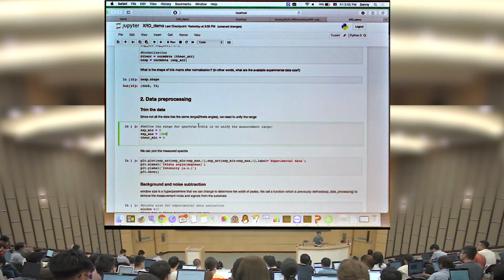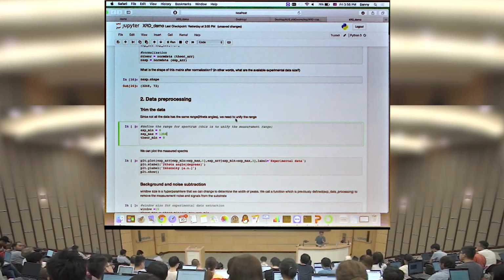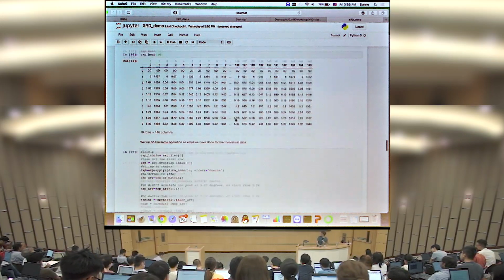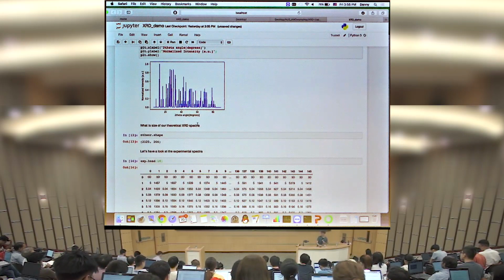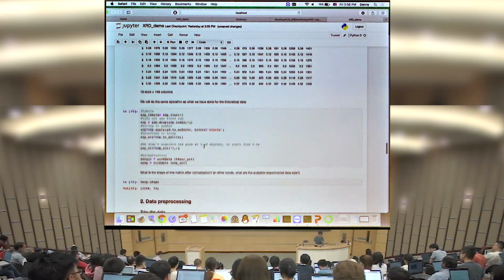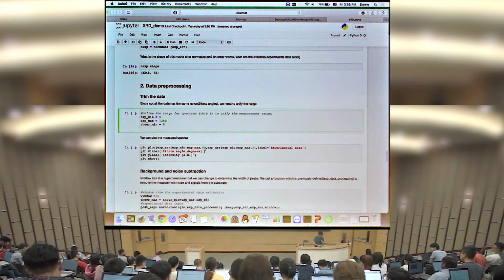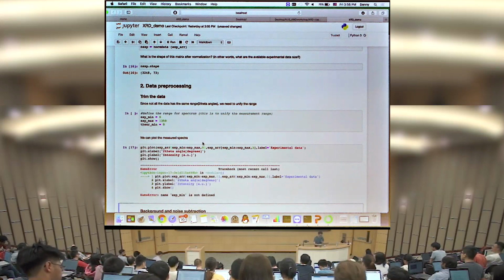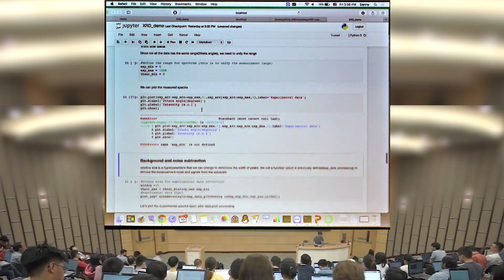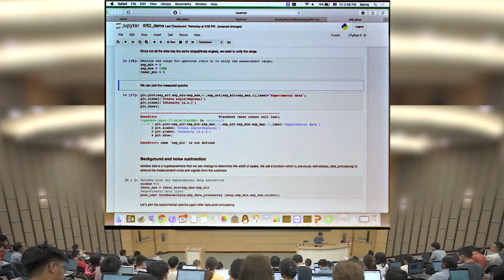First of all, we need to unify our data to be able to put it into the machine learning classifier. Because our x-axis is the 2 theta angles, we want everything to have the same starting and ending point for the 2 theta angles. So let's trim the data first. Oh, sorry, I have to run this block first and run the other one later.